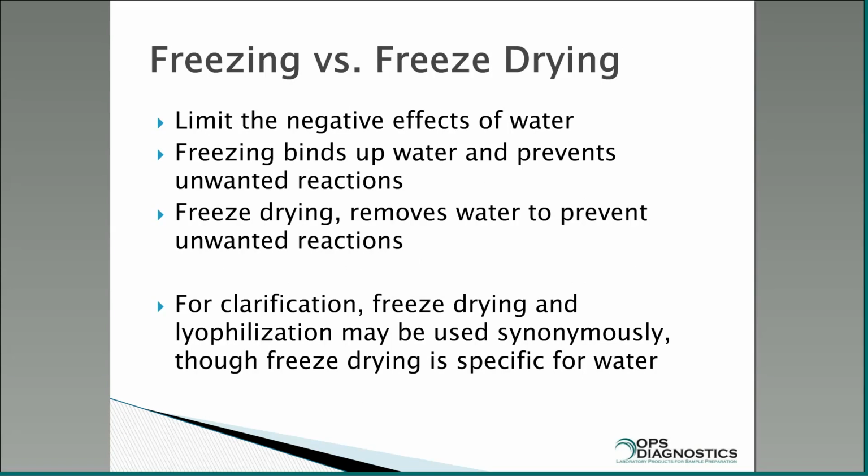And it takes a lot less energy to freeze something, but over the long term, it requires a lot more energy to keep it cold. A quick example of this is that I have a freezer that goes down to minus 140 centigrade. So I have liquid nitrogen tanks, and I have a freezer, and I always liked the freezer because I didn't have to refill it. And in our last location where our lab was, our electricity was paid for by the landlord.